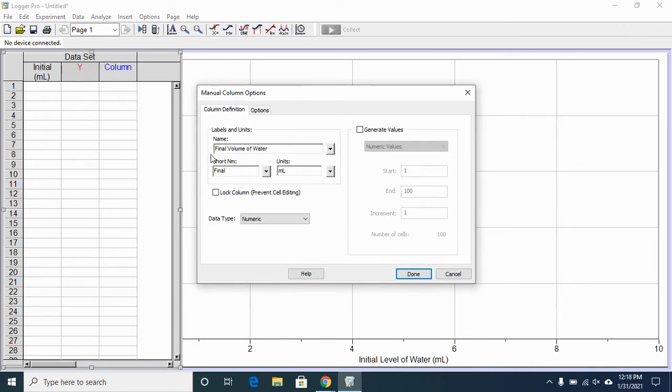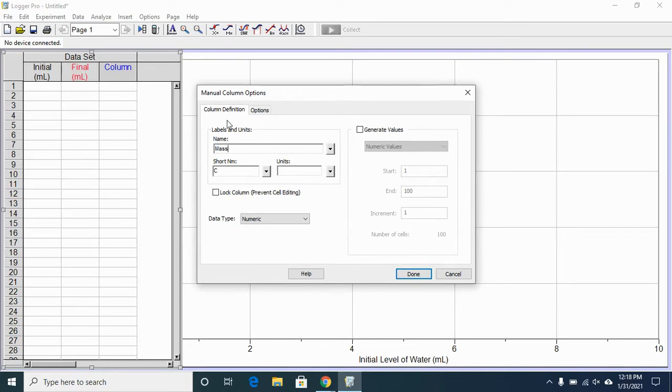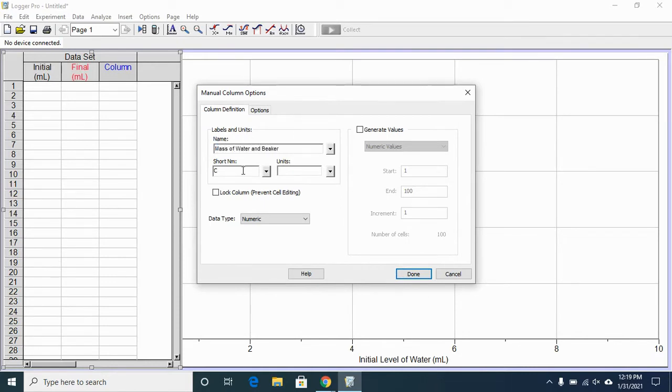I'm going to make this column the initial level of water. You can see here, I've changed the second column to be the final volume of water for each trial. Now, short name, final, and the units, milliliters, lowercase m, capital L. For the column that I had created earlier, that's the mass of the water and the beaker together, making sure that the short name indicates that it's the water and beaker together and the units are grams.